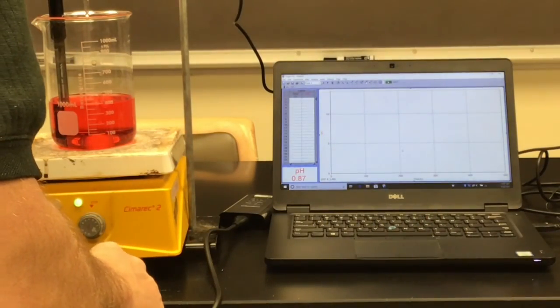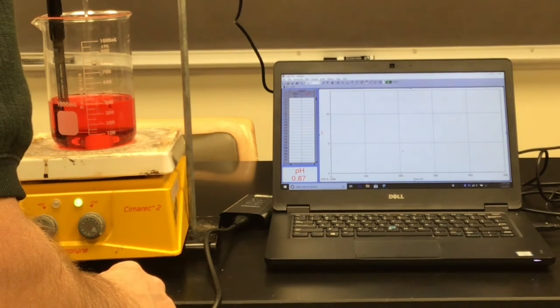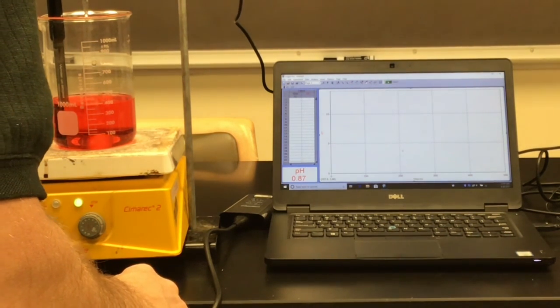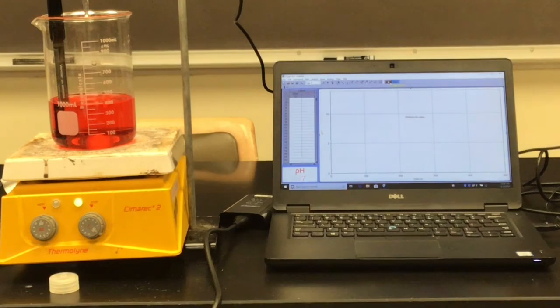I'm going to go ahead and open this up and just make it so that it drips. There we go. Drip, drip, drip. That's pretty good. And then I'm going to hit collect here. There we go. And collect. So we are drip, drip, dripping.